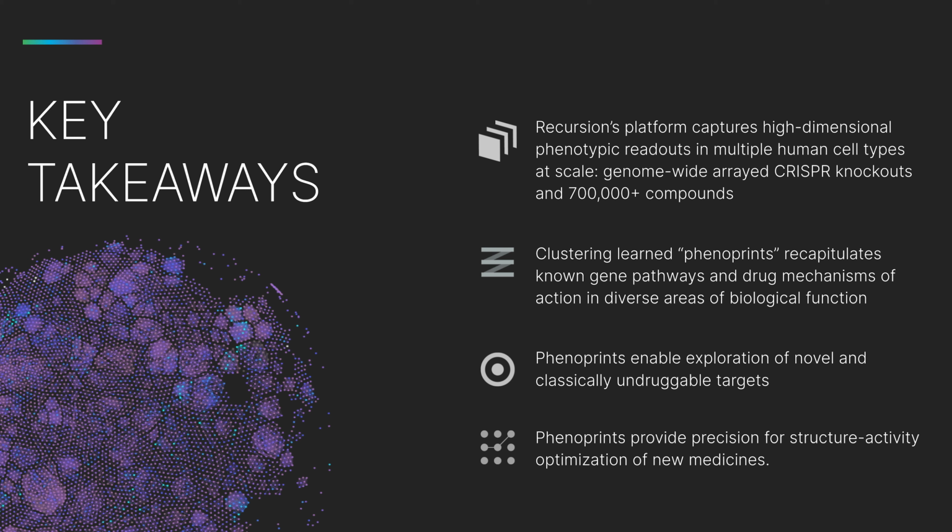In addition to supporting known biology, we can interrogate frontiers of novel and classically undruggable space, for instance, the mix story that we told earlier. These same learned representations and phenotypes can be used to direct search through chemical space for discovery and structure activity optimization of new medicines.